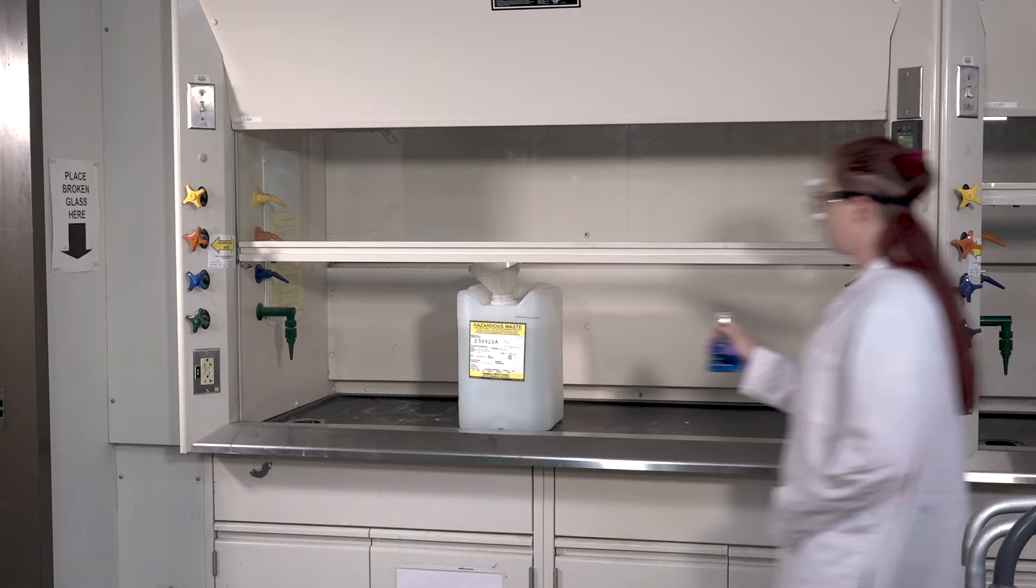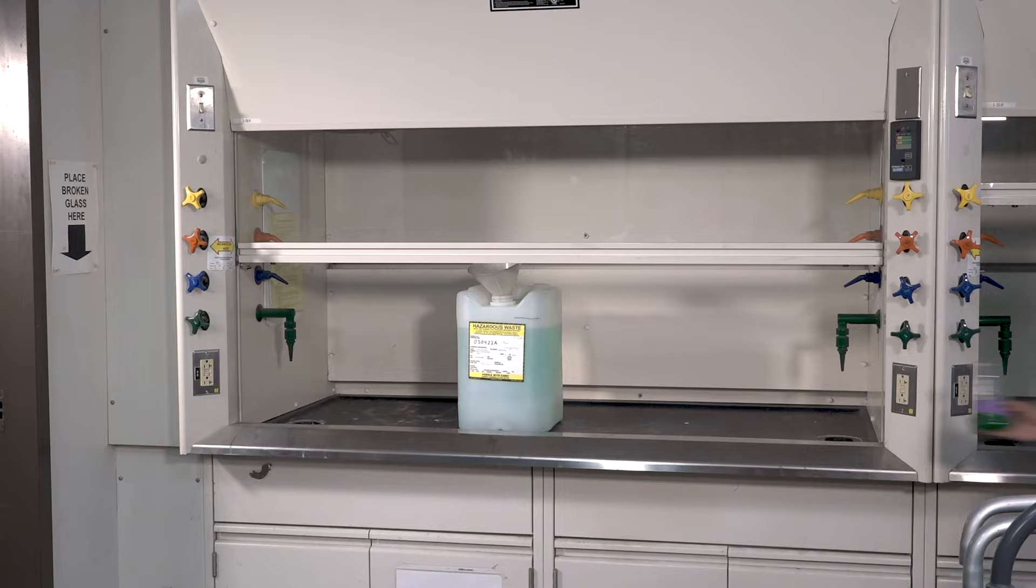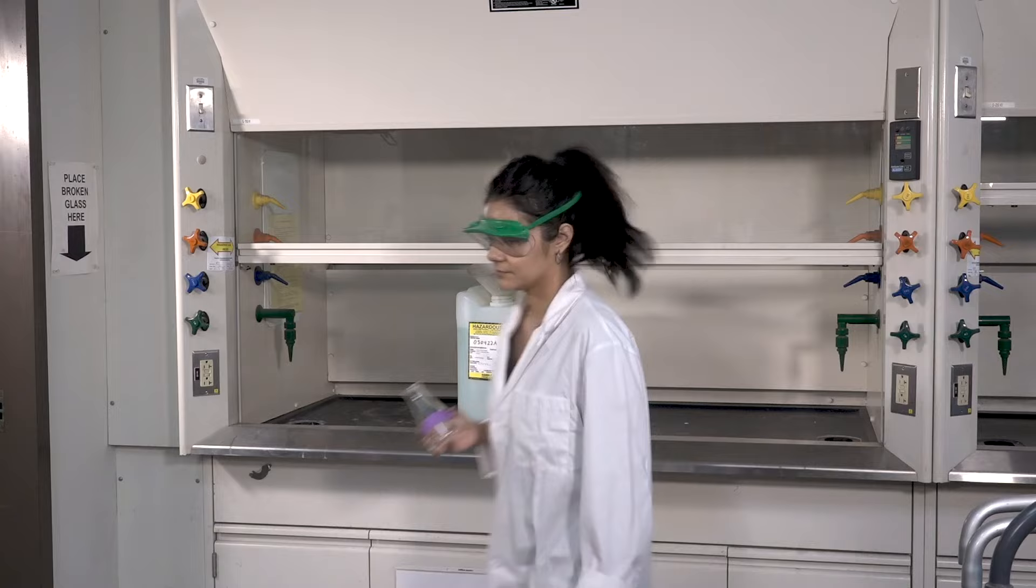All waste generated in the lab should be disposed of in the proper waste container. Never dump anything down the drain unless your instructor says it's okay. Waste containers are located in the fume hood and will be marked with the particular type of waste. If you do not see a waste container, ask an instructor before disposing of your waste.